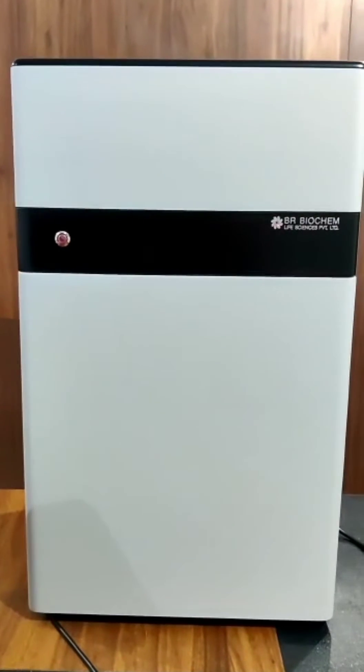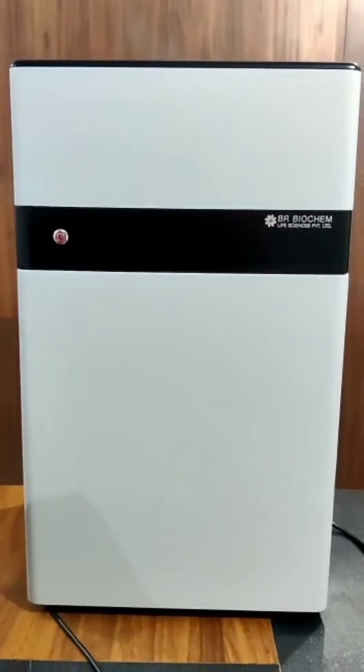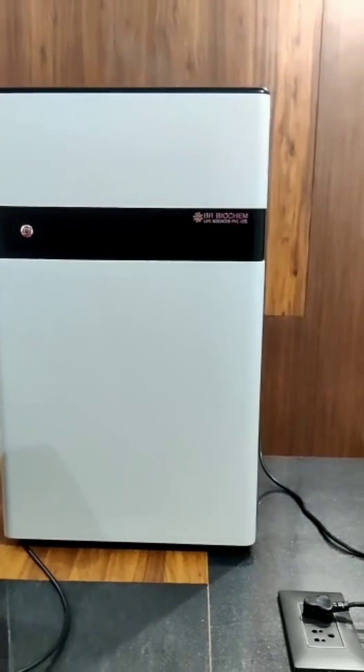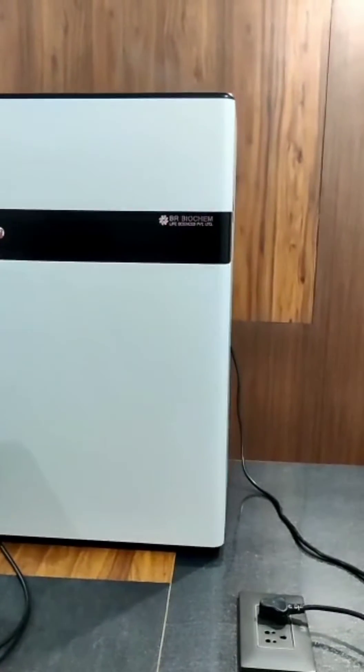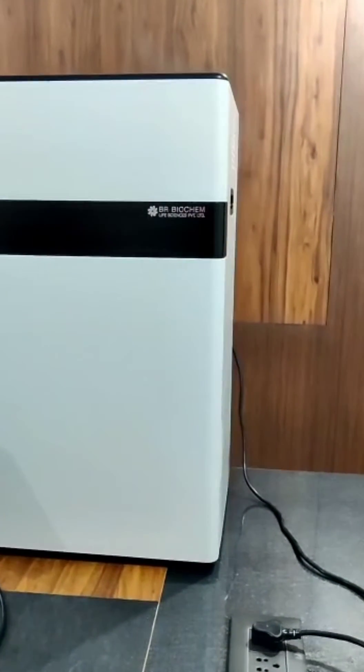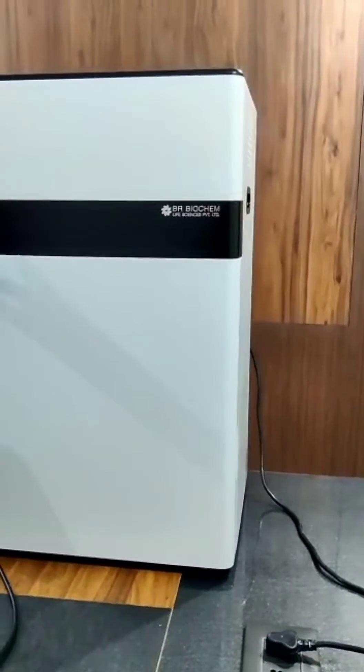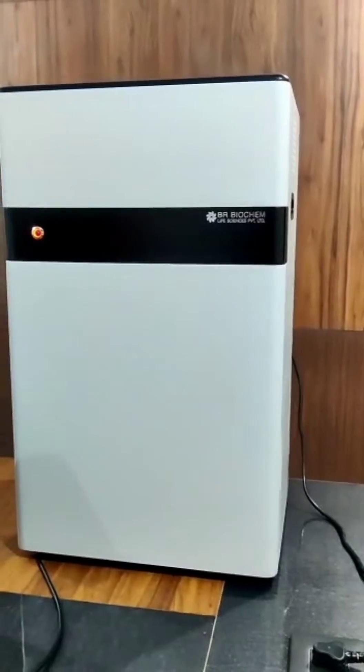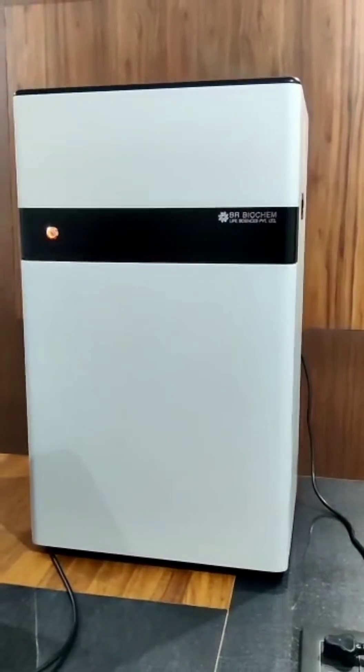This system is used for molecular biology applications. By pressing this key, the GEL Documentation System starts.